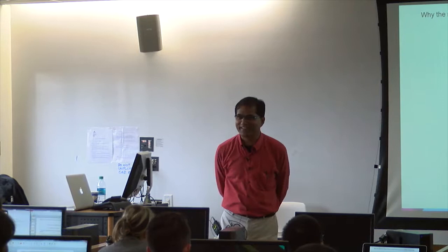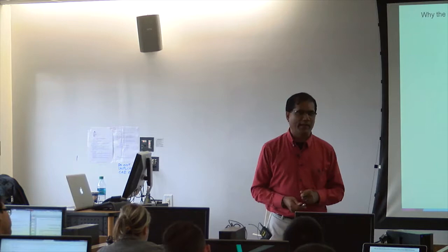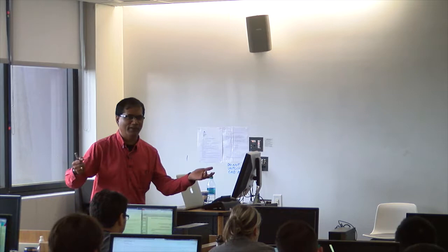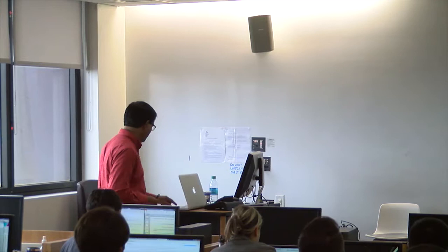Right. So what I'm trying to say is that although it is doing great, every great technology has its own plus and minus, some deficiencies too. Let us see the greatness of microarrays. More or less, you are convinced. I could see that glow on your faces about how we could utilize that one human genome. But let us see what the concerns of the microarray technique are.